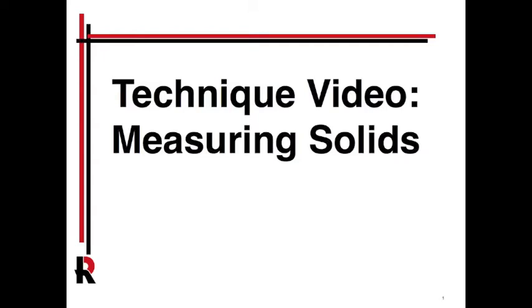This is Ross Weatherman from the Rose-Hulman Institute of Technology, and this is a quick little video on how we measure mass in the general chemistry laboratory.